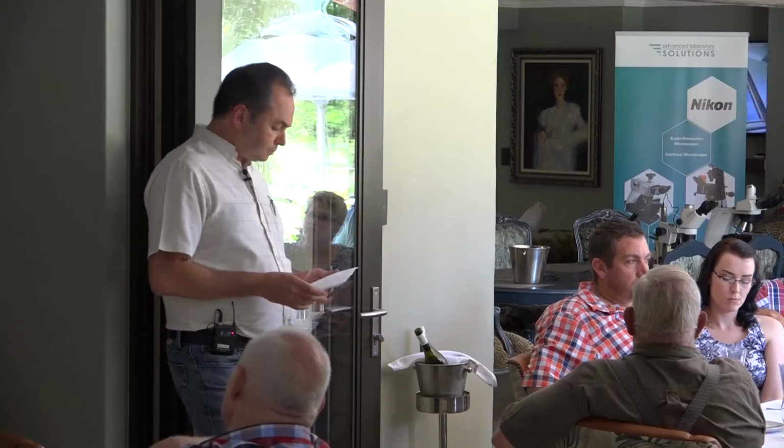With phase contrast, you're looking at what they call a phase shift in the light, and you actually see the sample. You'll actually be able to define it without having to go through the process of staining. So it's a good technique. And these are generally bright field, dark field, and phase. These are very common on microscopes.